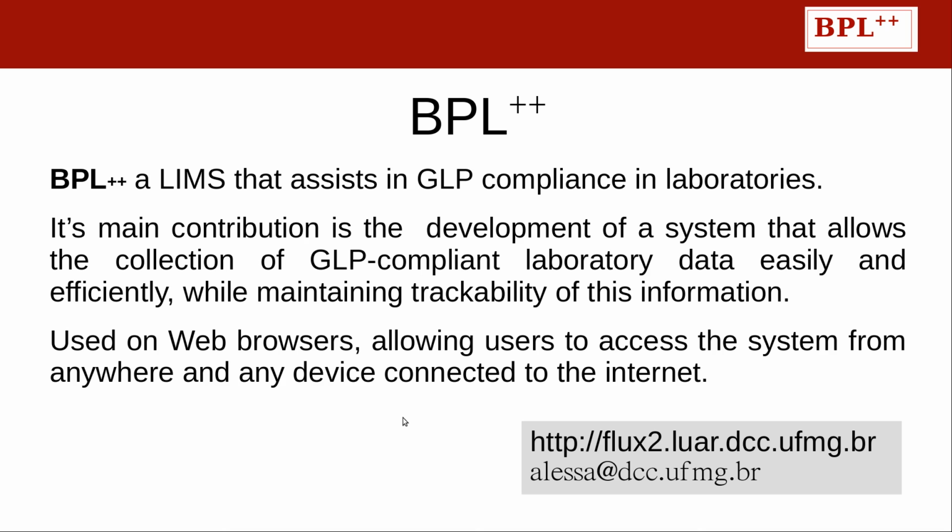GLP compliance is an important quality assurance system. However, its implementation can be complex due to high costs of GLP assisting systems, modification of laboratory routine, and personnel training. This work presents BPL++, a LIMS to assist laboratories in GLP compliance.